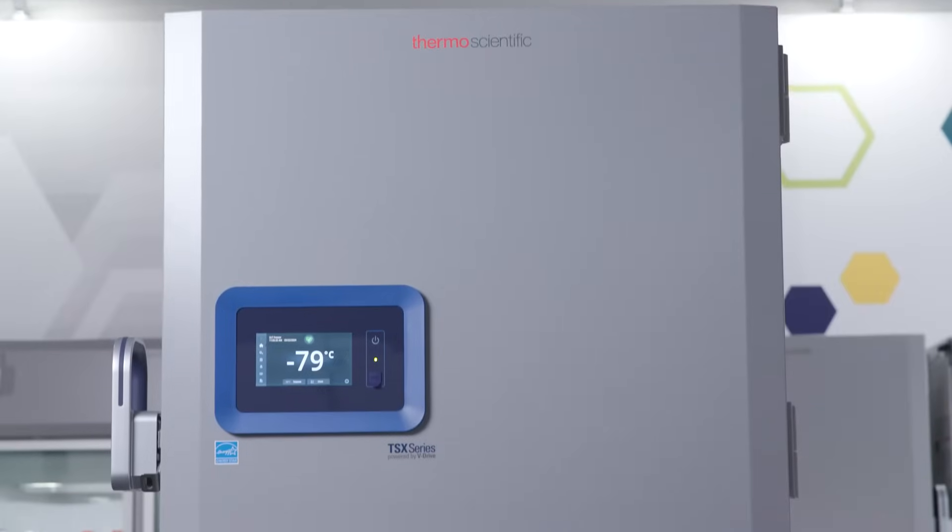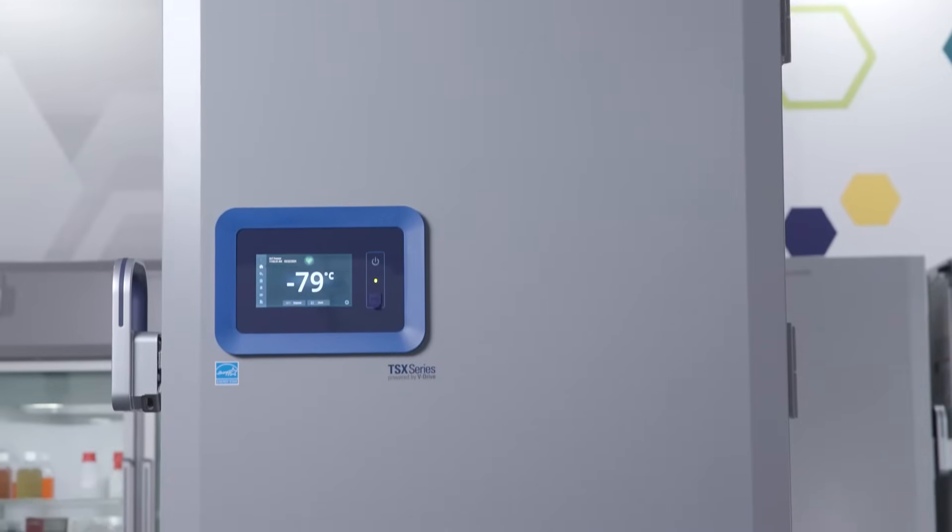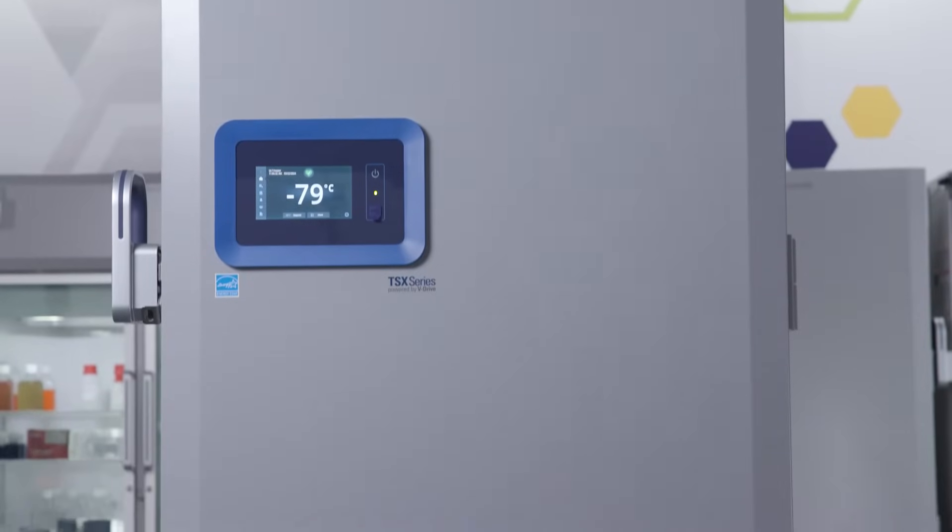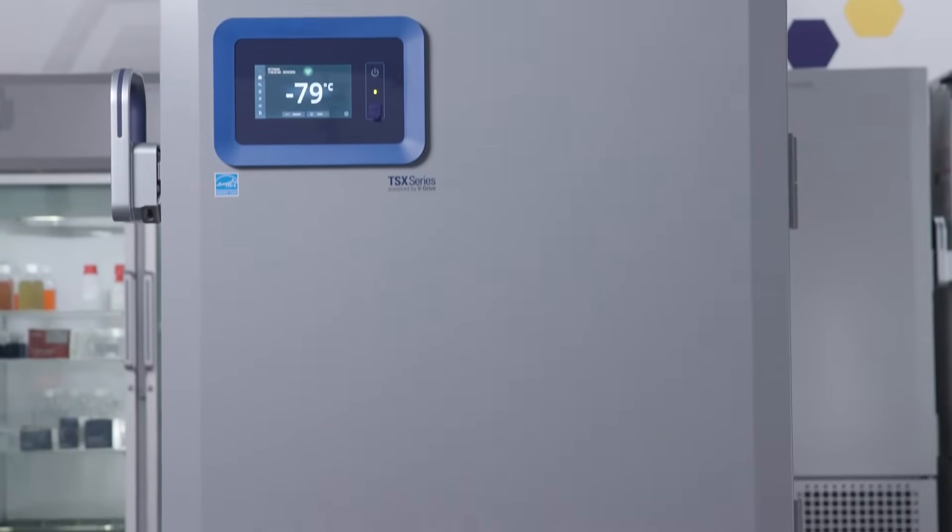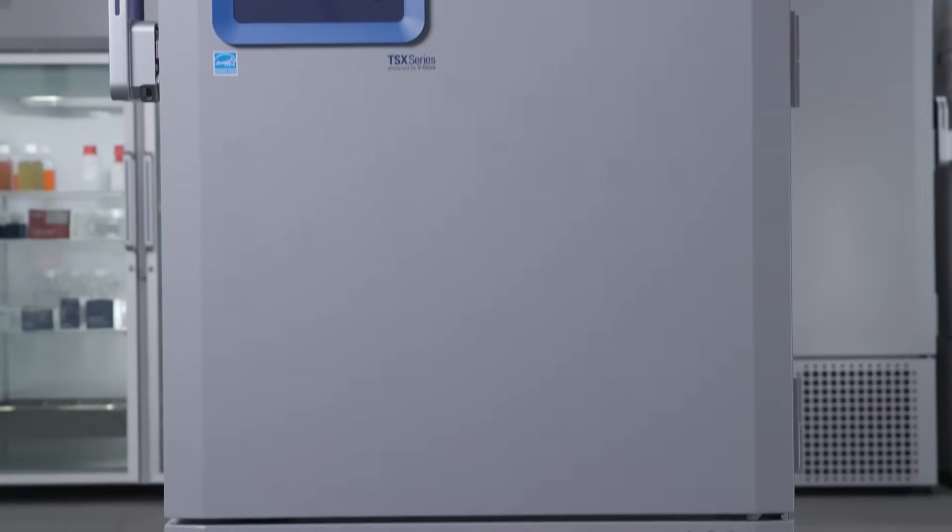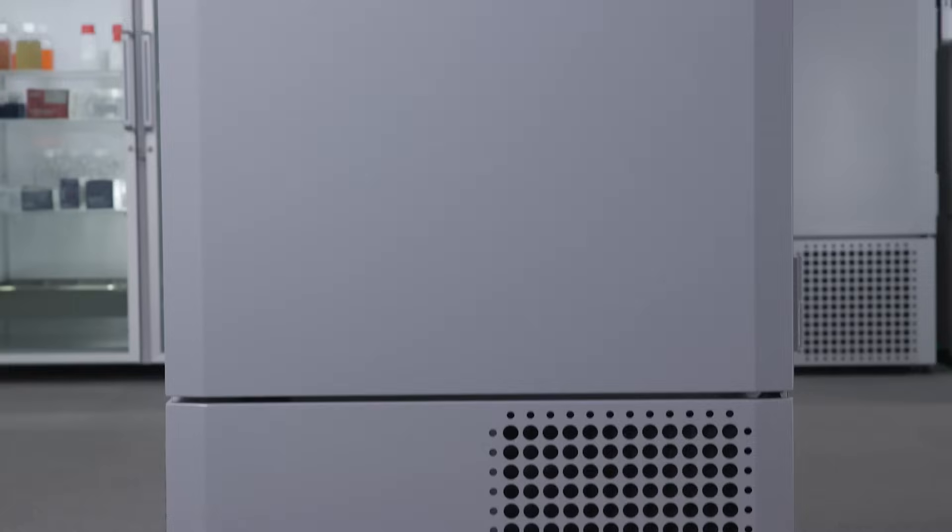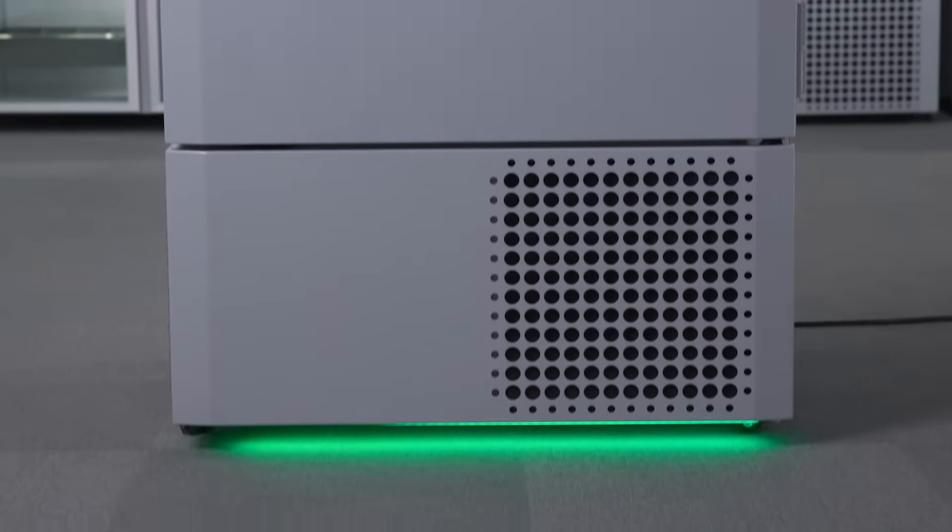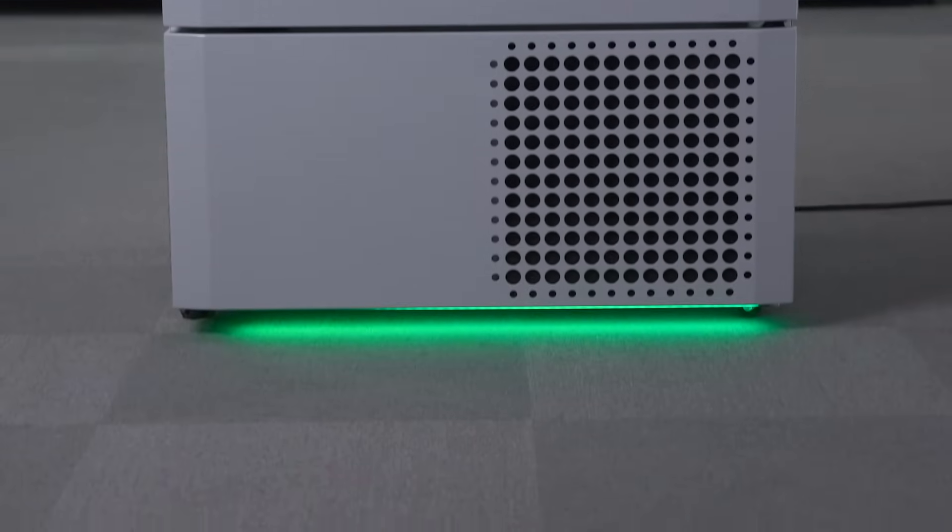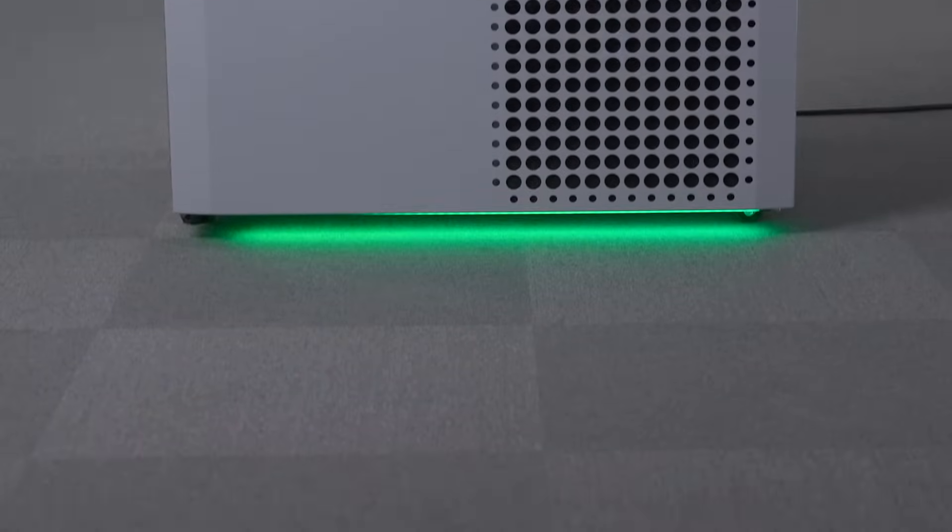Hello and welcome to this video about utilizing the 5-volt and PoE connectivity power ports on your Thermo Scientific TSX Universal Series ULT Freezer.